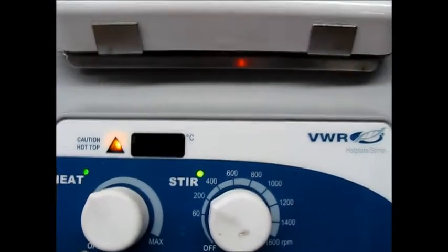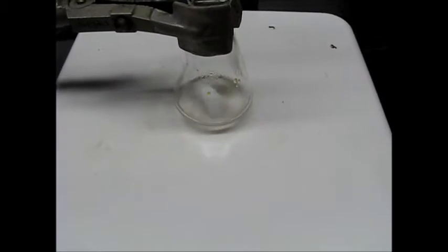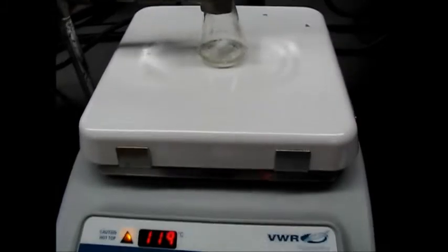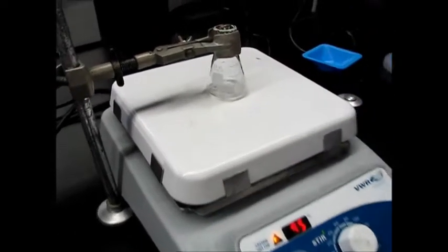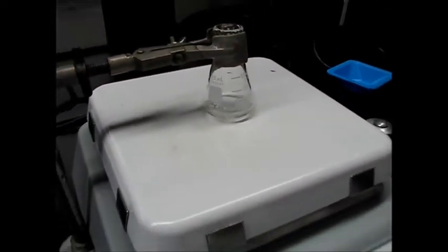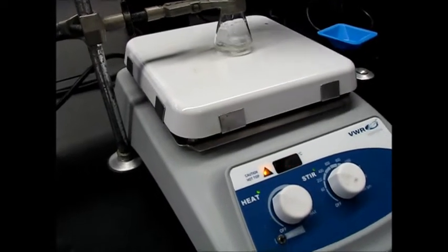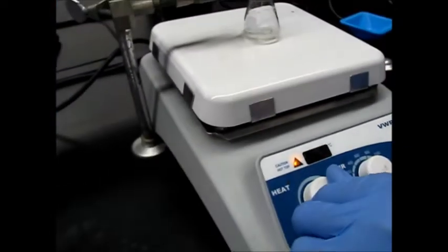This reaction is fast, and here you can see it changes color within 2 minutes, and heat is still on. All right, we've let it stir for about 5 or 6 minutes now. It's completely colorless, as you can see, so that means that all of the 9-fluorenone is out of solution. Now we're going to start the workup part of this reaction. So we're going to turn off the stirring and turn off the heat.